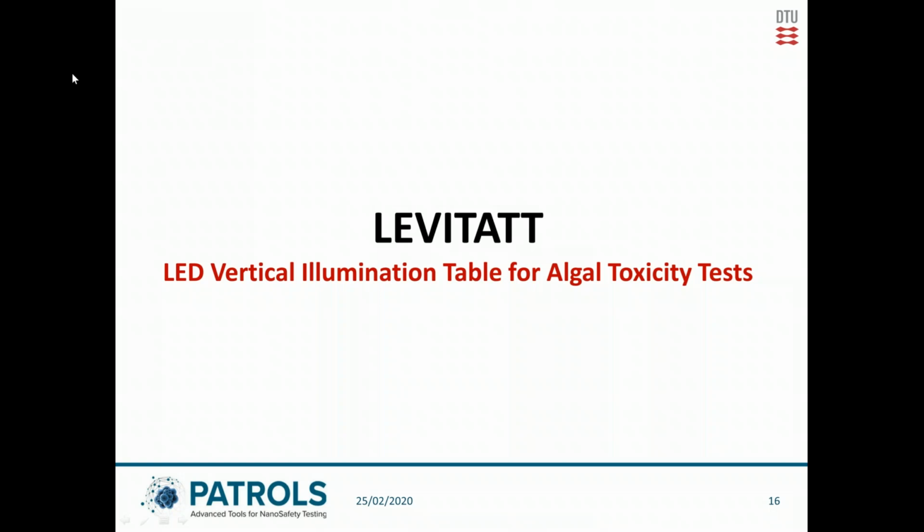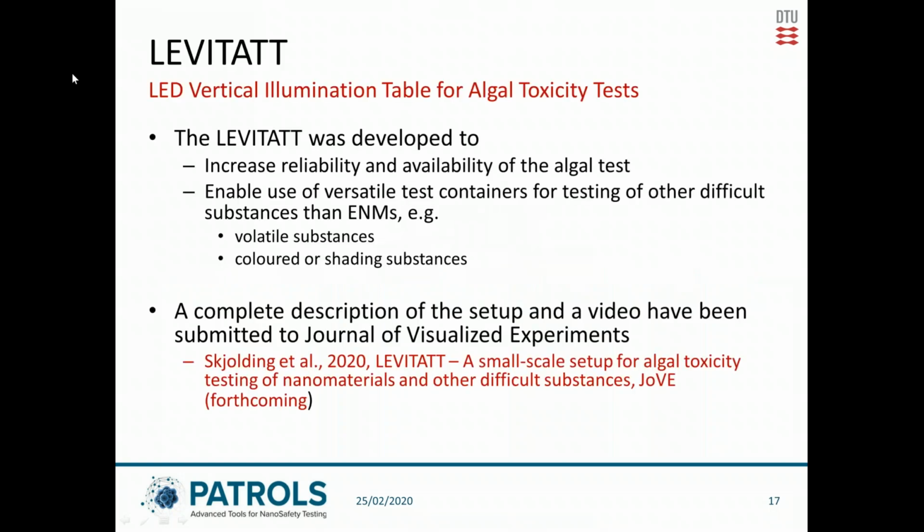Yeah, my name is Lars Skjolding, and I will present to you the LEVITATT, which is an LED vertical illumination table for algae toxicity testing. Basically, the LEVITATT was developed to increase the reliability and availability, as Anders just mentioned, and it was also developed in order to be able to test more difficult substances such as volatile substances or shading or colored substances. This is done through the use of versatile test containers that can be changed to meet the needs of the given substance.